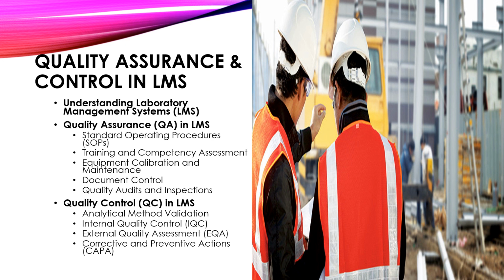Now, the key components of quality assurance in laboratory management systems include standard operating procedures, SOPs. Documented procedures detailing the steps to be followed for each analytical method, instrument operation, and data analysis. SOPs serve as guidelines for staff training, ensuring consistency and uniformity in lab practices.